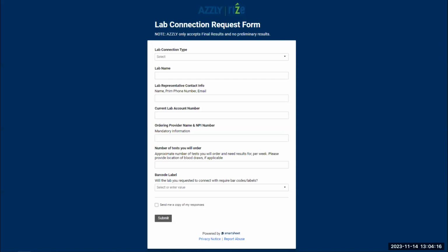It can be a process timing wise. Many of you know that on the lab side, it doesn't happen overnight. So if you feel that those facilities that you're serving will benefit, we certainly hope you do, we recommend that you put the connection request form in. Let's get this going. With the existing ones you have that might be on unidirectional, let's get them bidirectional. And then any others, we hope that you will encourage them to do the bidirectional with us.